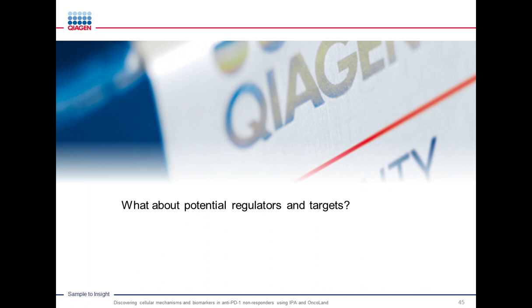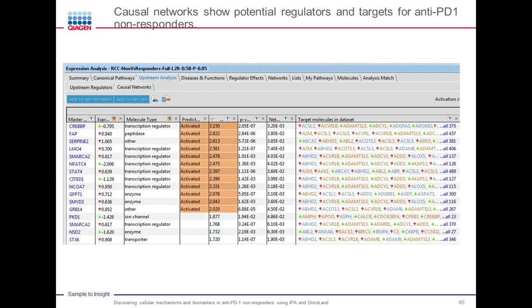Now that we have focused both on mechanism of action and biomarkers, what about regulators and targets? In IPA, we have some powerful tools such as upstream analysis and causal networks, which will allow you to focus on regulators and targets. Using that, I have discovered over here many transcription regulators that are connected to renal cell carcinoma and also found to be activated by IPA. And you can see them in the center of your screen.